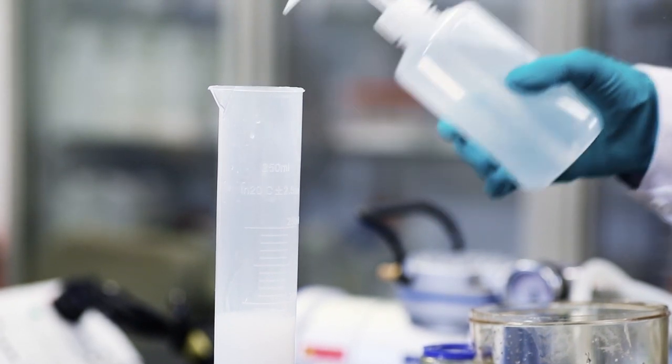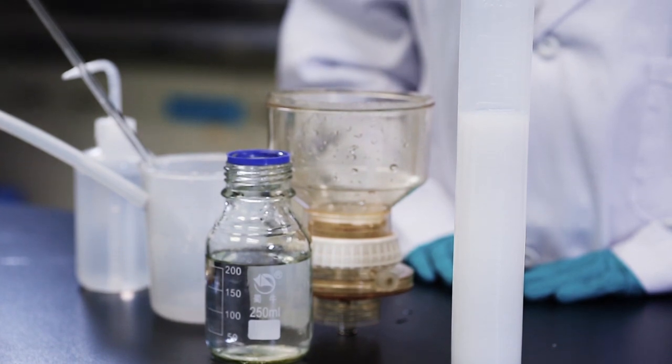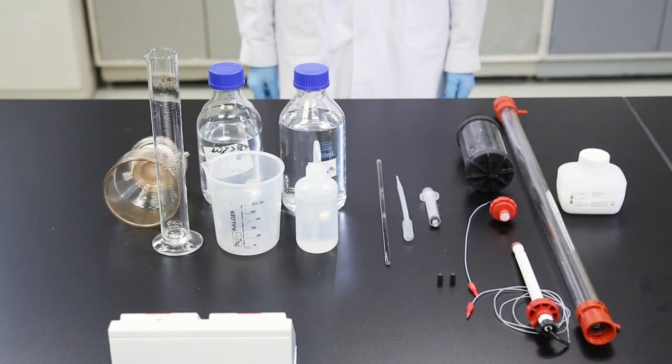After the last wash step, add packing solution to obtain the slurry concentration for the specific resin and column type. Now that you have prepared the resin, the next step is to prepare the column.